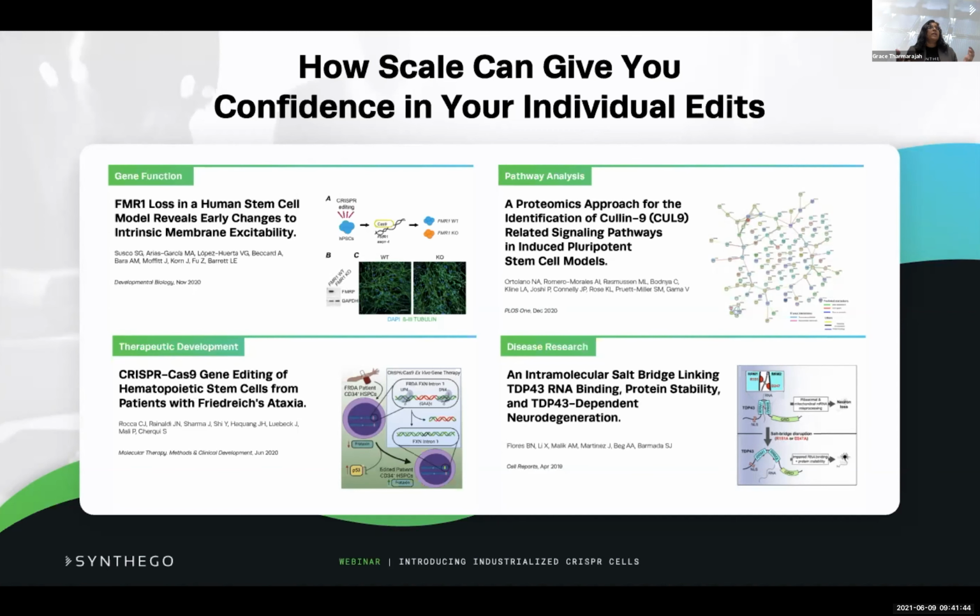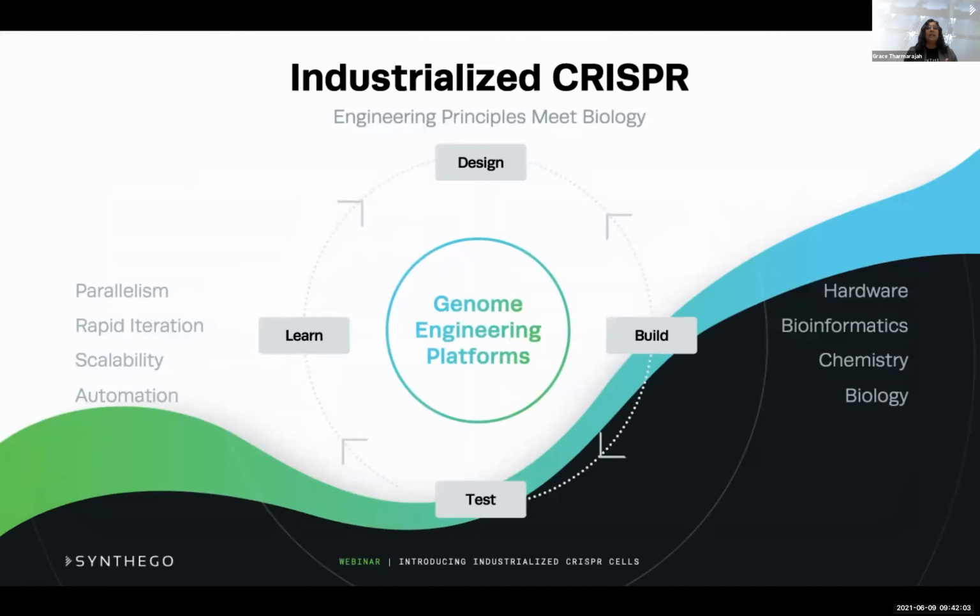And so really what we're showing here is there's a variety of ways you can take your cell models, the engineered cells that we're pulling off our platform, and carry them down to downstream assays and research in different ways. So that brings me to the conclusion of what I wanted to talk about today, and I'll pass it back on to Kevin.